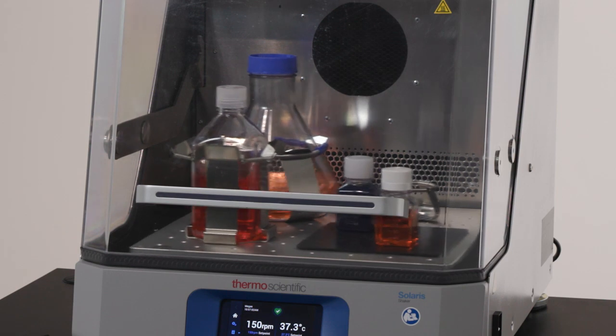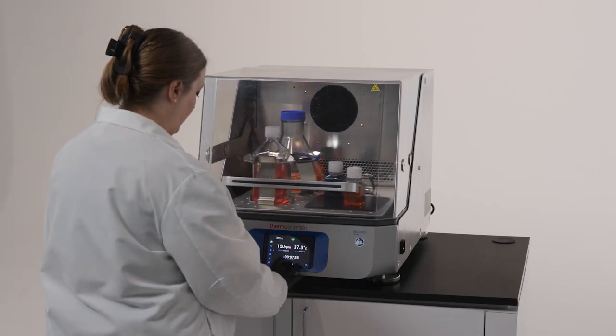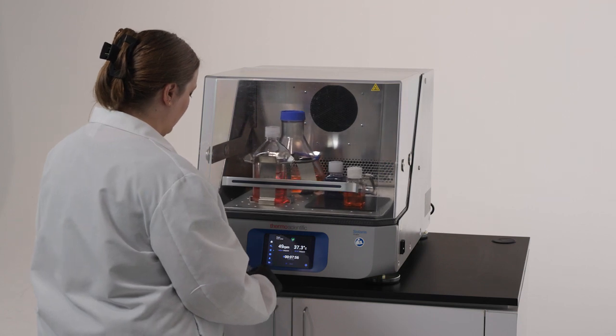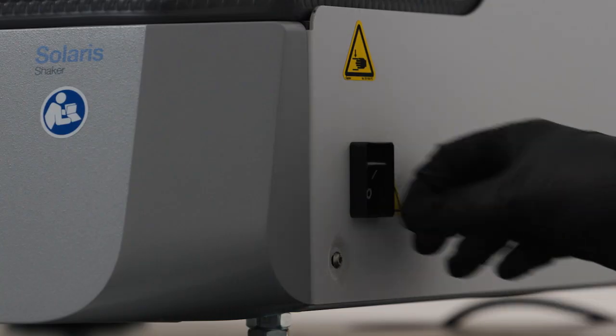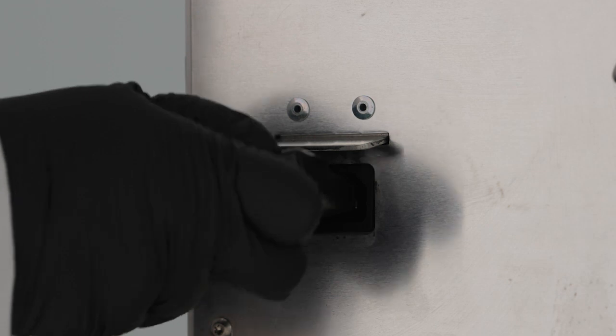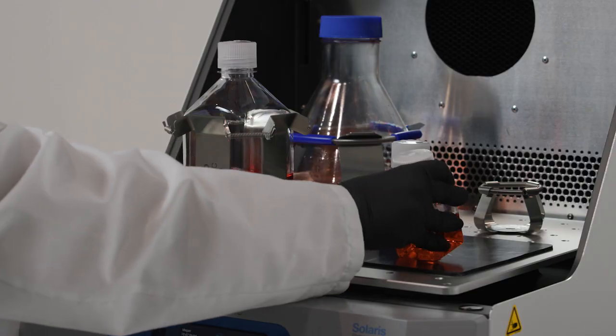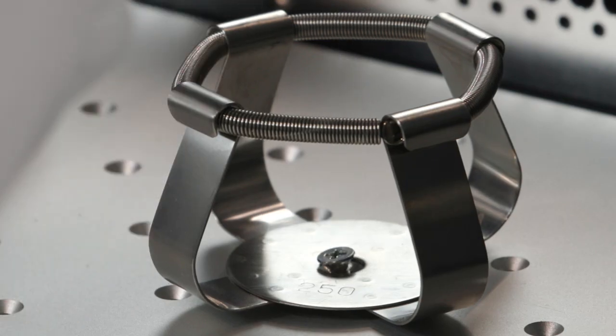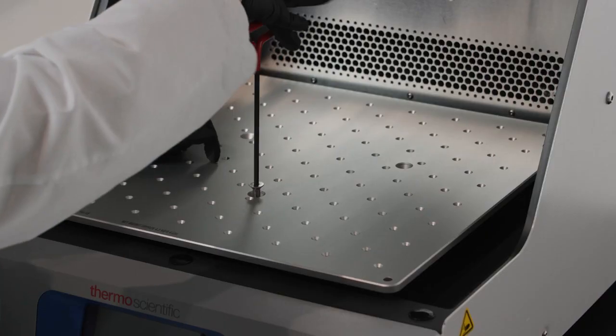Unfortunately, spills happen, but Solaris benchtop shakers were designed to protect the shaker mechanism from these accidents. Before cleaning your shaker, turn off the unit and unplug it from the outlet. Carefully remove any accessories and vessels from the shaker, and then unscrew and remove the platform.